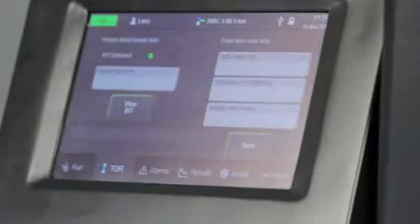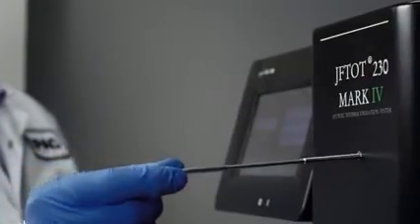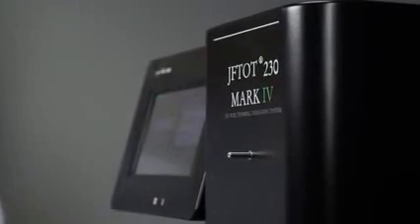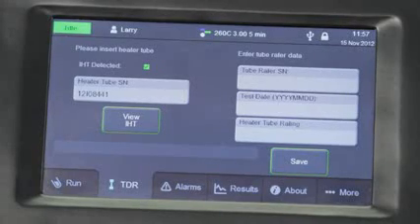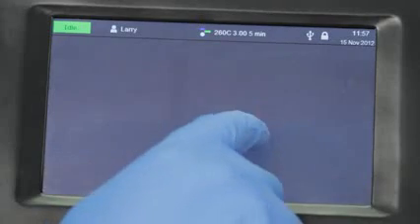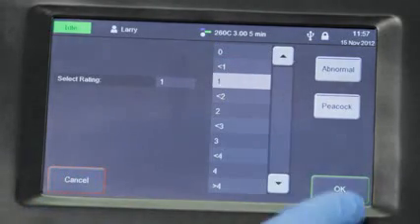Next go to the TDR tab. If you used an intelligent heater tube like this one, insert the IHT into the reader slot located at the top of the instrument. The IHT serial number will automatically populate in the serial number field. Select the tube rating from the drop down menu, press OK, and then press the save button.